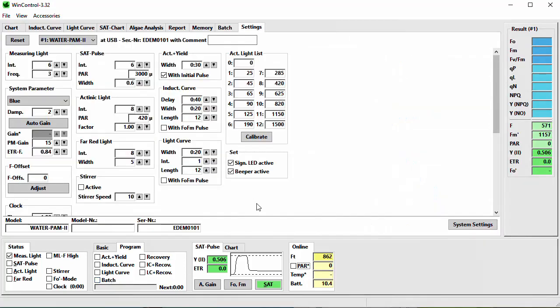The last field of the Status panel is the Online field. Here you can see the current FT value and the PAR value in the cuvette. The checkbox here needs to be empty — it is for other instruments when you use an external light sensor.